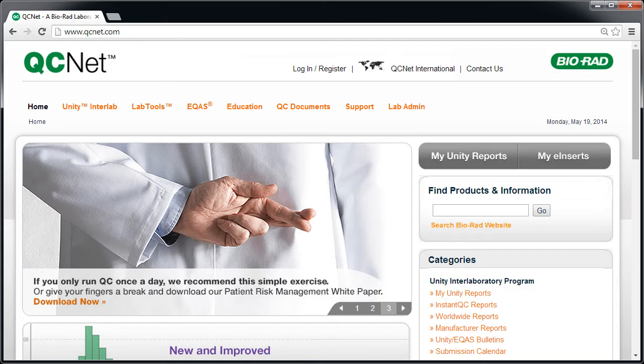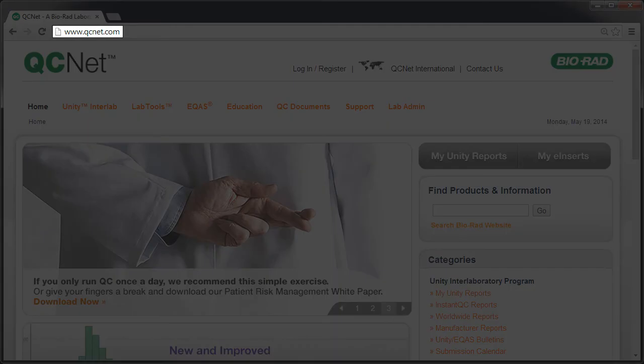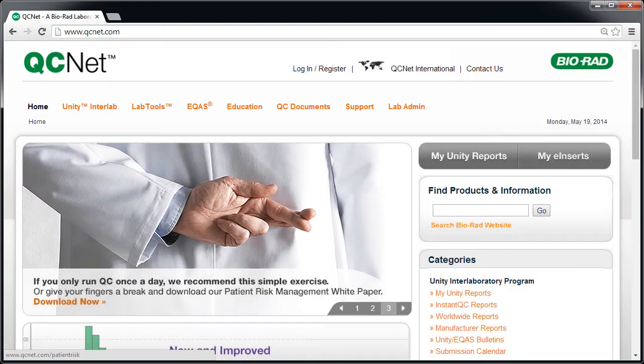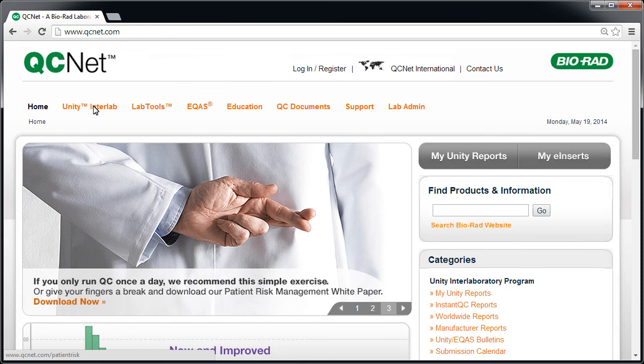Let's get started with a brief orientation. To access Unity Real-Time Online, go to www.qcnet.com. Select Unity Interlab and Unity Real-Time Online.